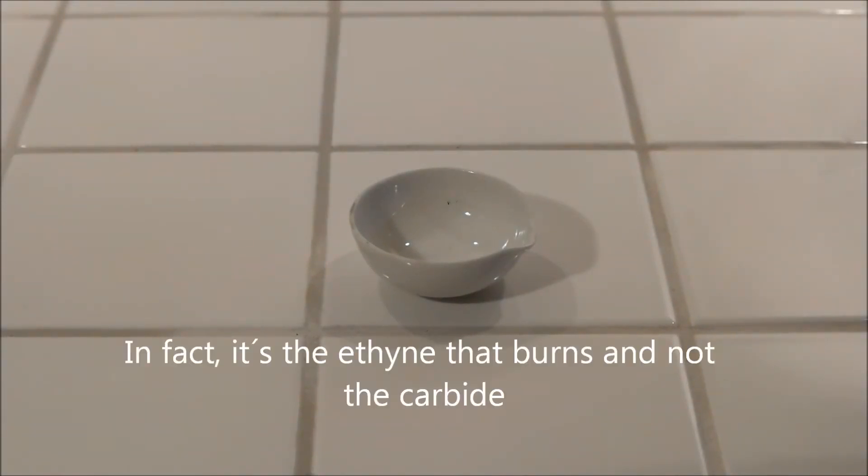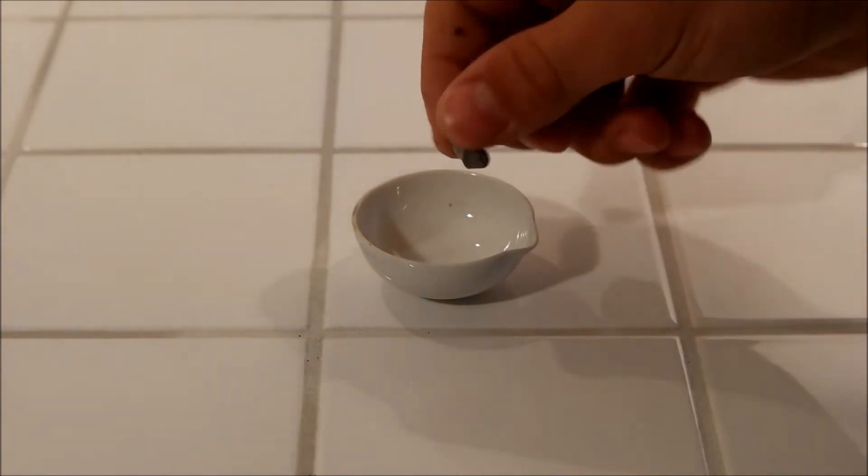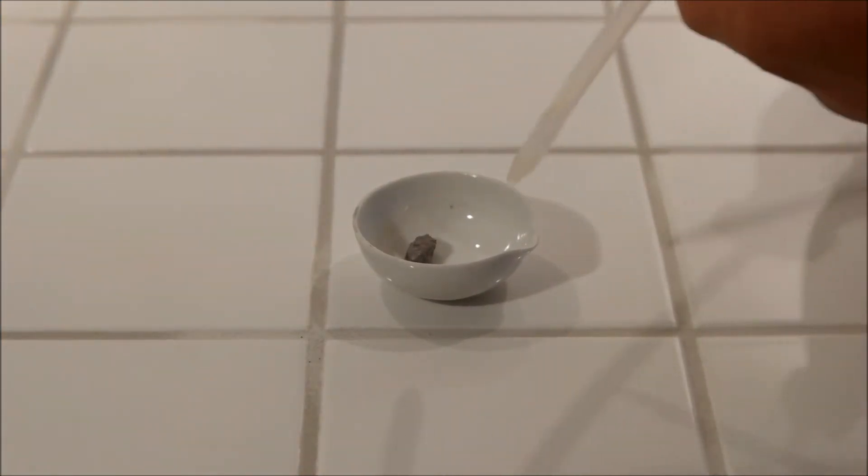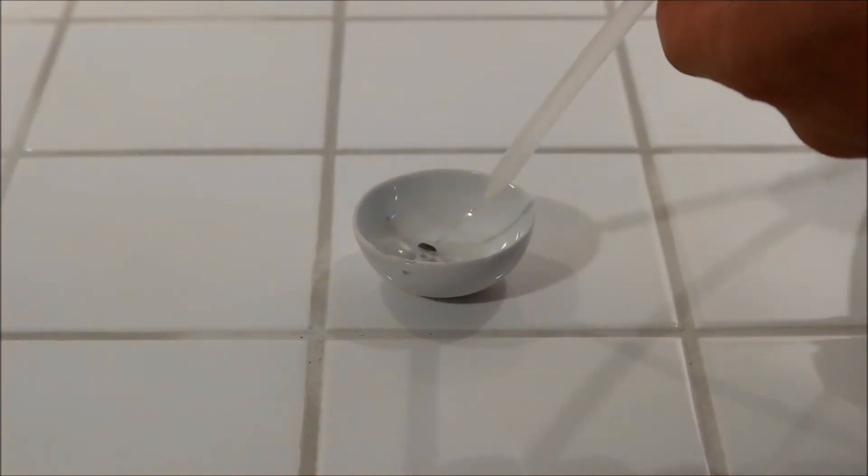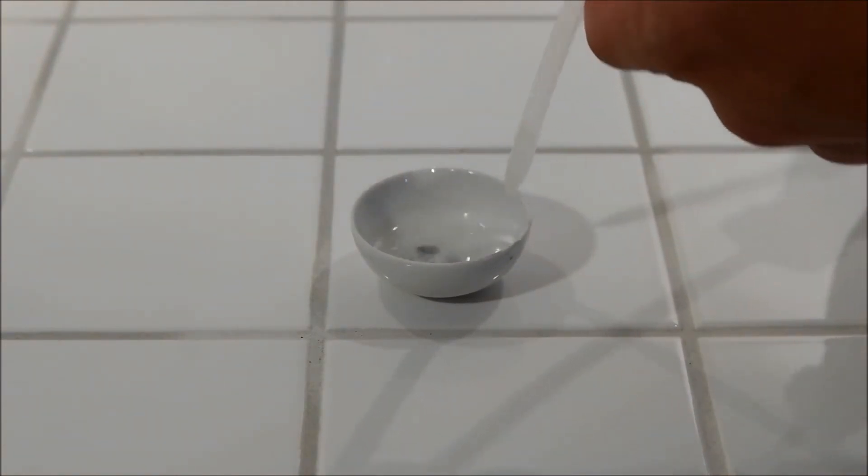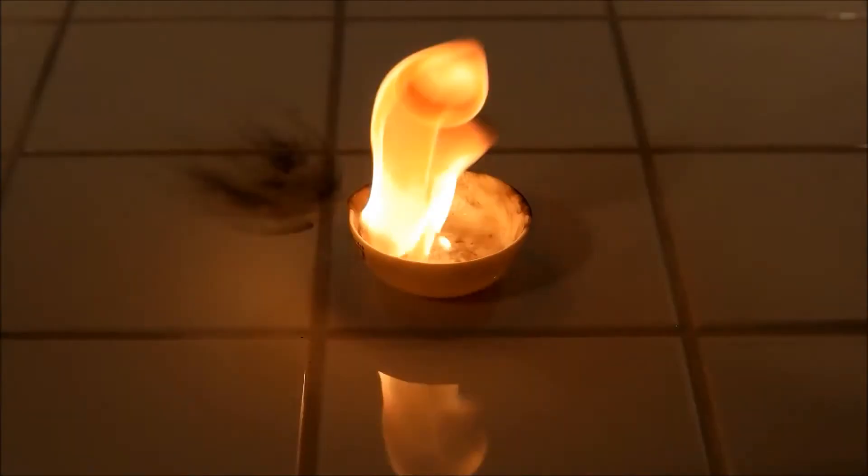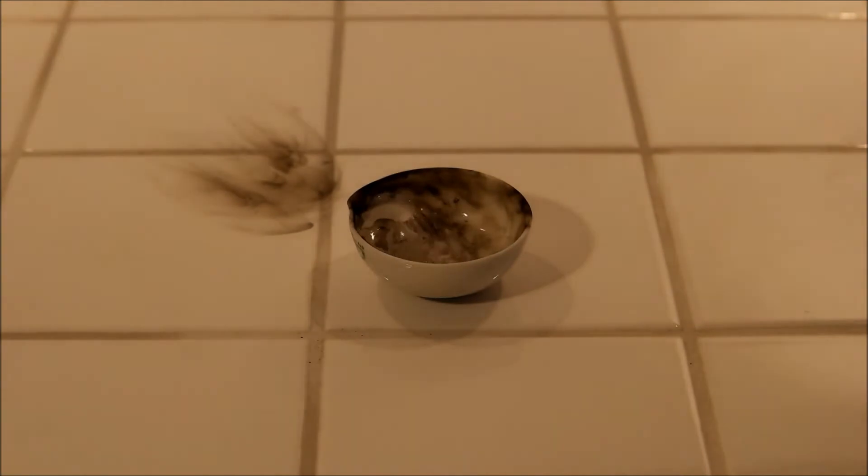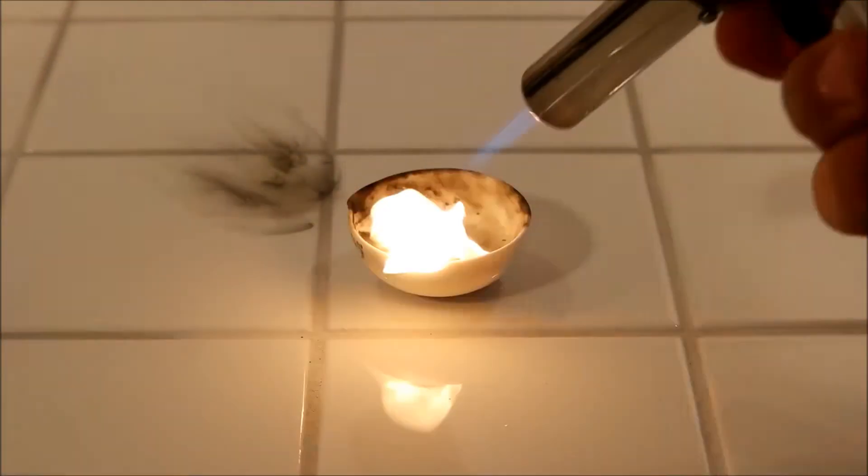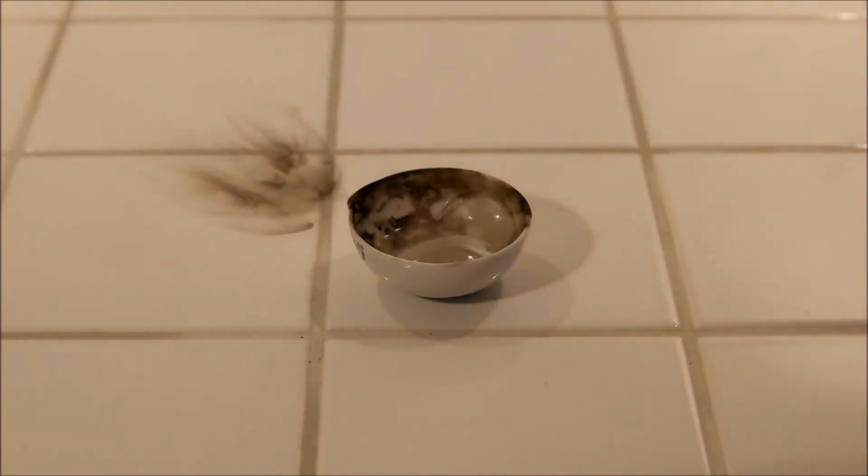Now I want to show you how calcium carbide burns. So I put a small piece of calcium carbide here and I put some water on it and light it up. What you can see is that a lot of carbon black is produced, you can see it fly here, flying everywhere.